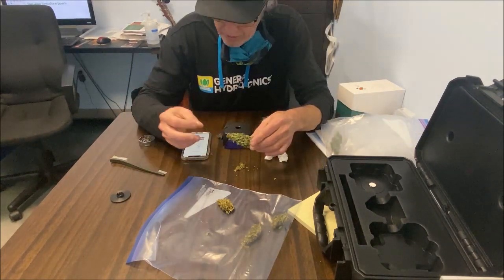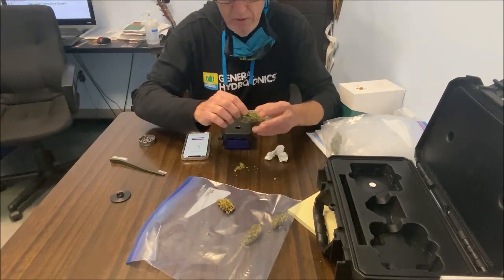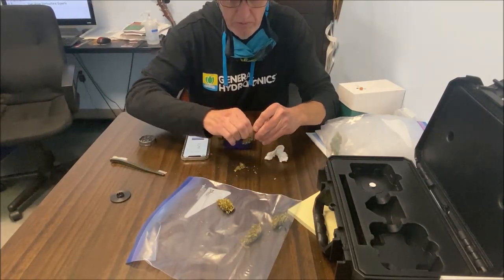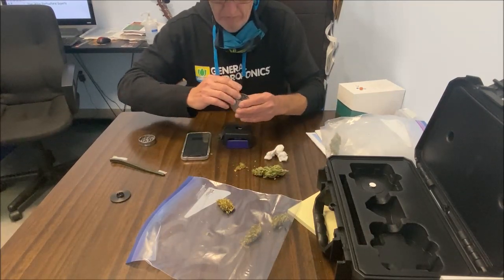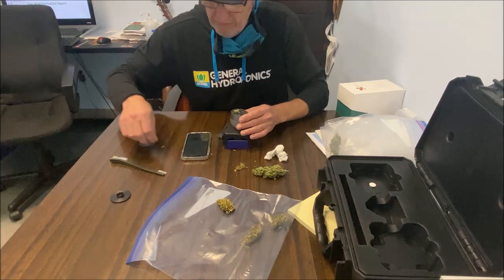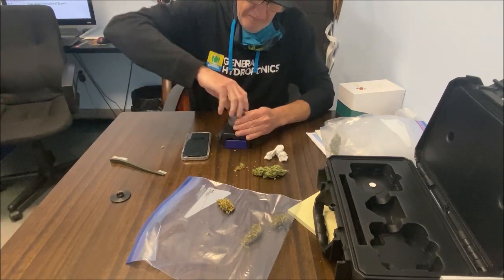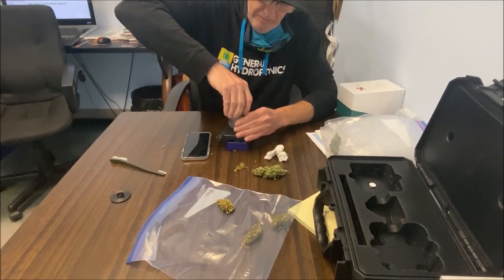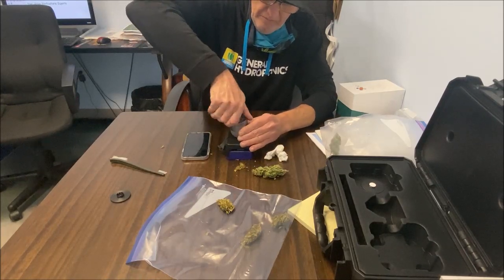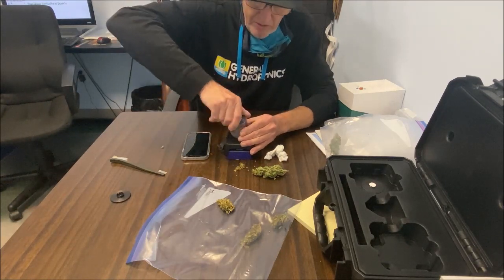Okay, next we're going to do the Clean Chemo. Let's see where it came out. So I'll take a piece, I think I'll take it off down here in the middle somewhere. And we'll put that into the grinder. Grind that up. In there.